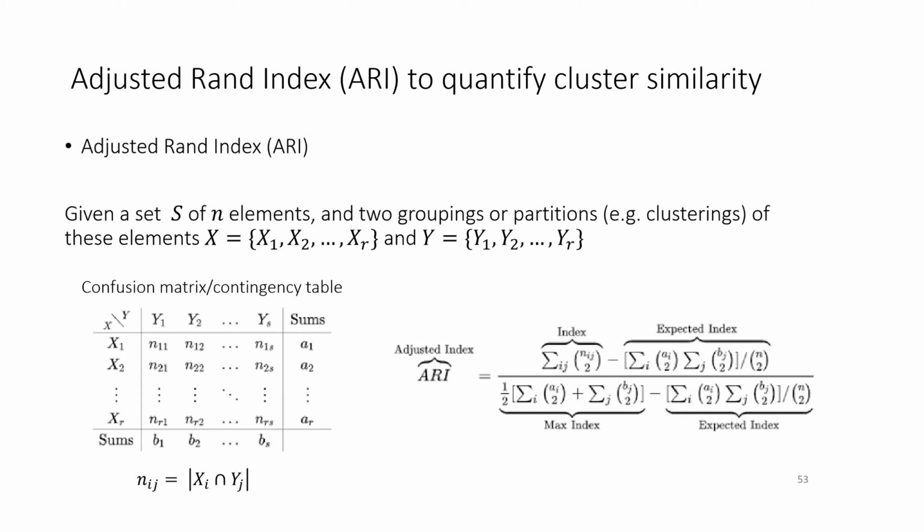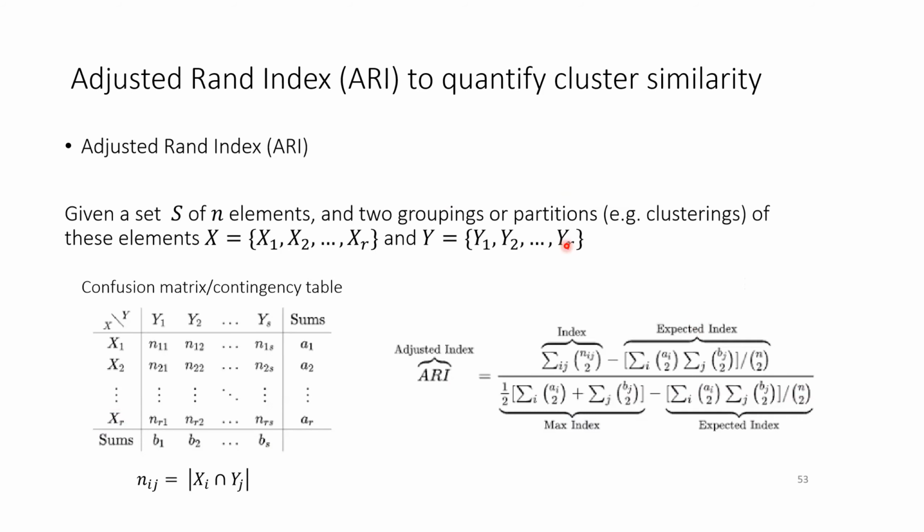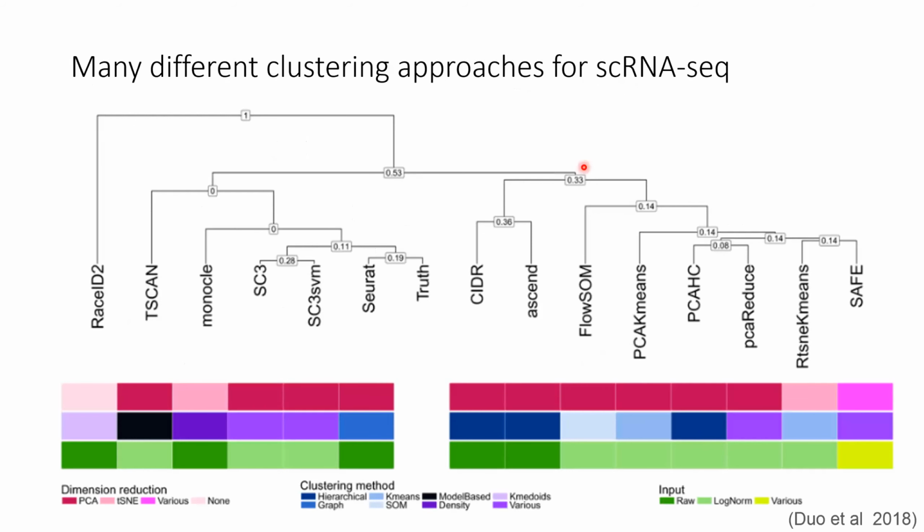And the stability of ARI scores, as well as the total number of cells within a cluster, can both be used as a measure of clustering stability and potentially be used as a proxy to assess whether some stable mathematical object exists that can be reliably partitioned using our algorithm of choice. The ARI scores are also useful when comparing to a set with a priori labeled truth values. So if you do FACS beforehand, you can ask how well your clustering recovers the set of known FACS labels. And this is the experiment that was done in this slide.